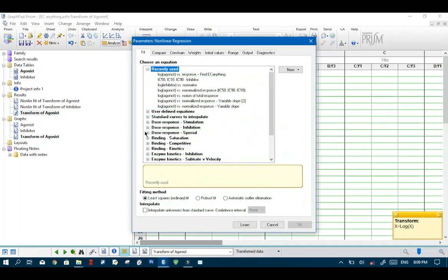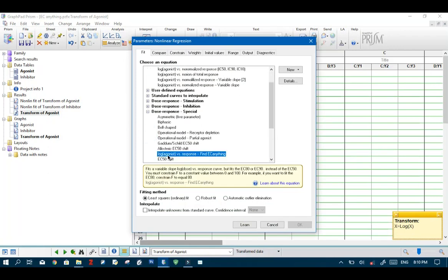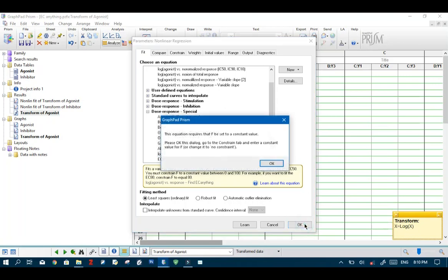Now you want to select nonlinear regression and hit OK. Now next under dose response special we will select log agonist response find EC anything. Hit OK.